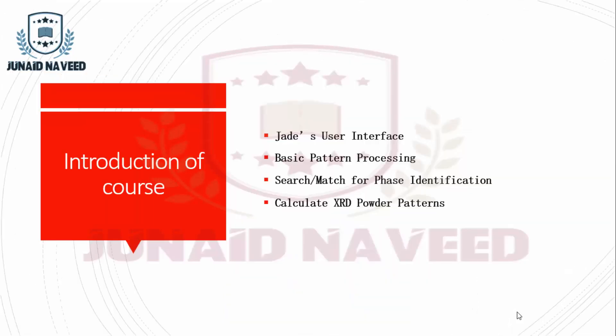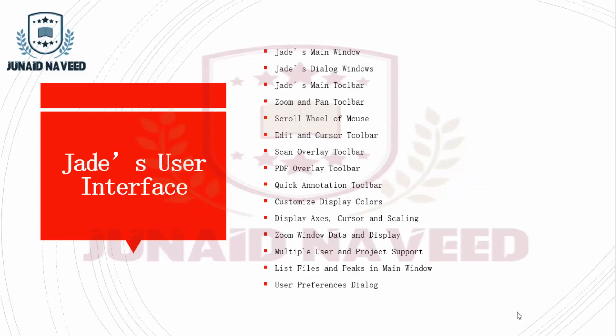What will I be discussing in this course? I will be discussing four main things: user interface, basic data processing, search match for phase identification, and XRD powder patterns. These are the four major modules of this course.